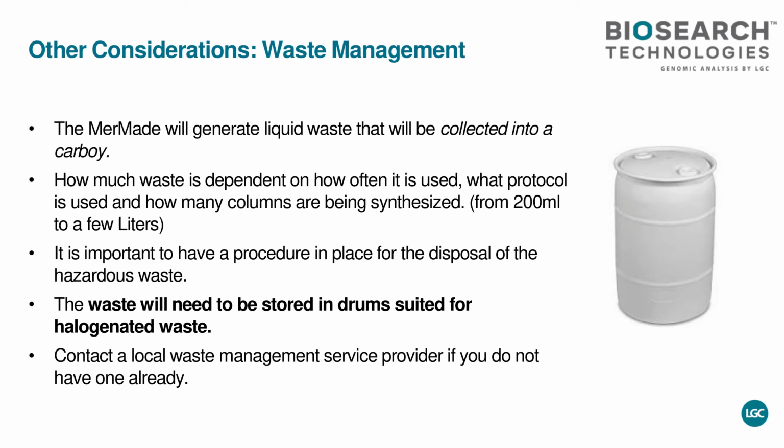If you make, let's say, a few oligo nanomole per day, your waste will be quite small in terms of volume. If you produce, let's say, around 200 milliliter. If you produce, let's say, 24/7, 100 oligos at 5 micromole scale, you can directly arrive to a few 50 liters, 100 liters, and you have to think how to manage that. You will have to check internally how to manage and how to keep this waste.